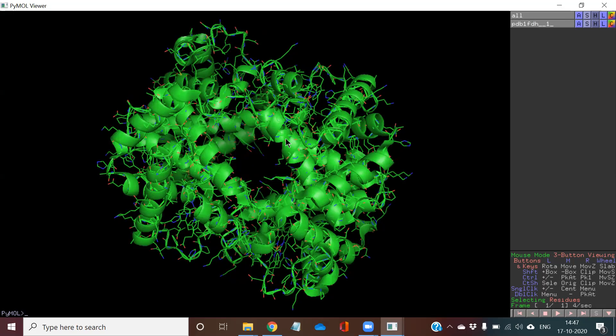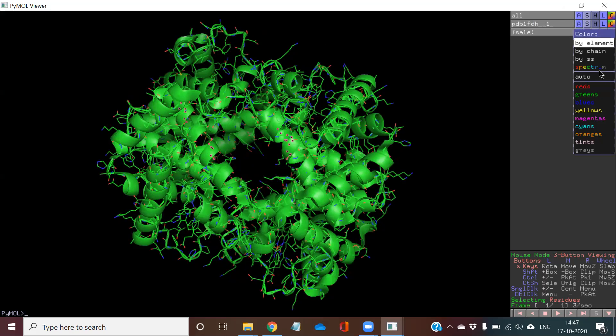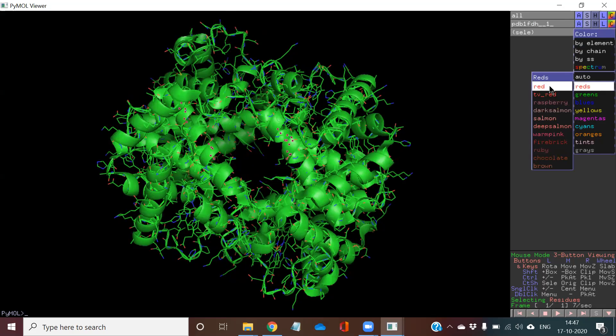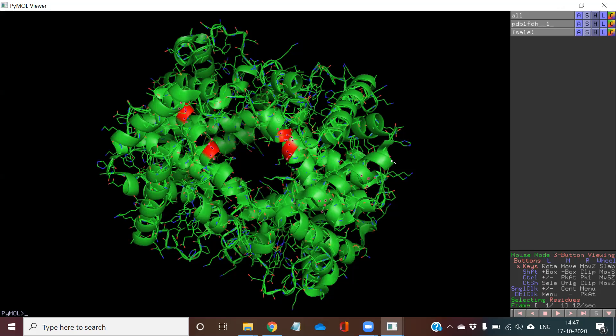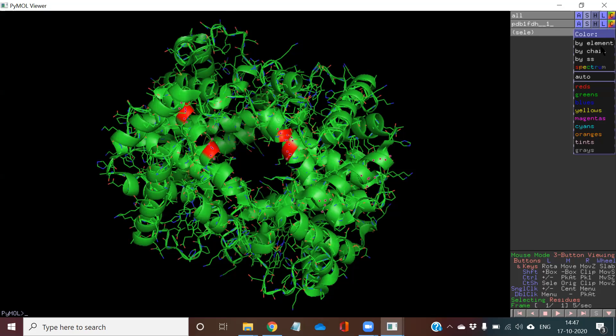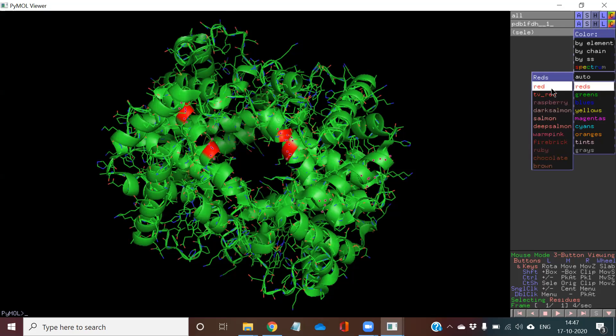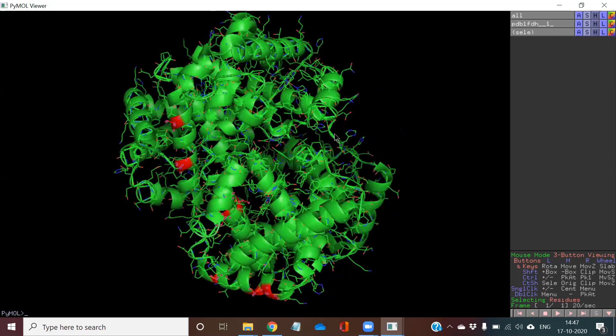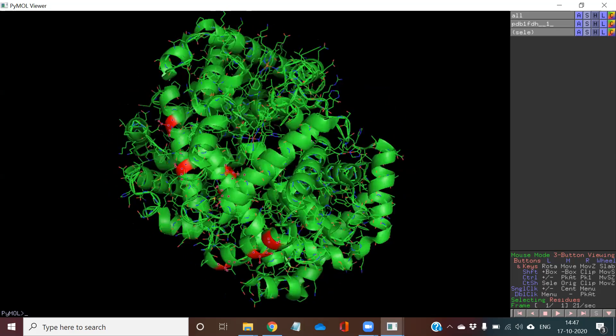Or else, if you are going to select some part on the protein, you select it first and then you can give some other color. Suppose I am giving a red color, so that part will become red in color. Once again, I will show you: select the part which you want to and then go to this part color and then give red color. This way you can work with the structure of proteins.